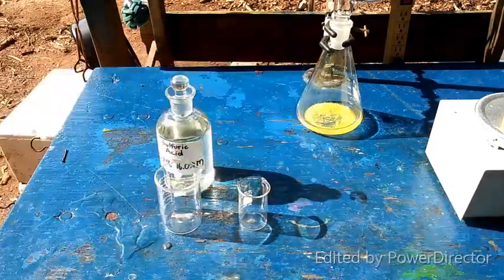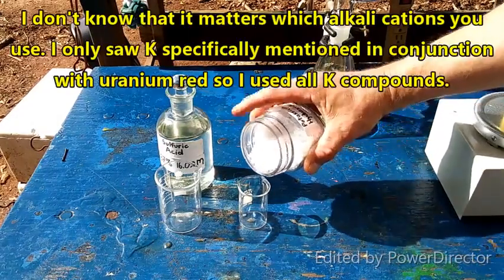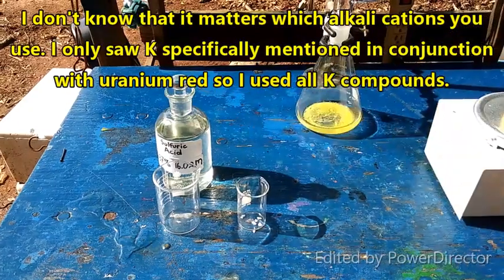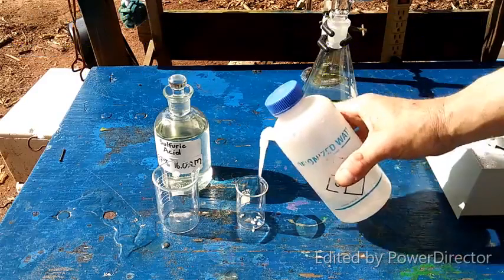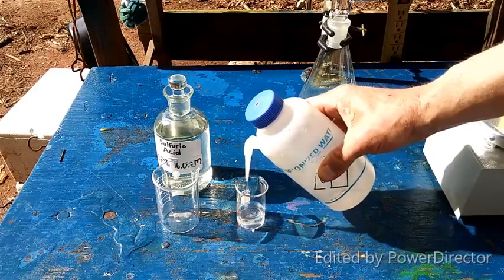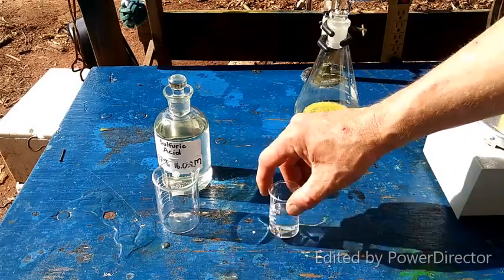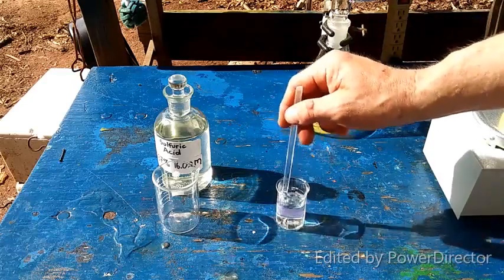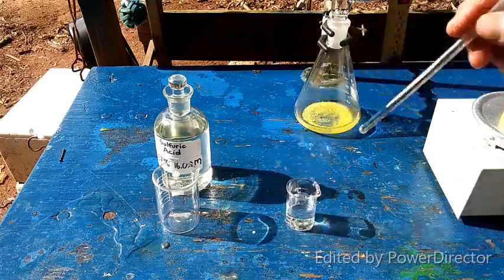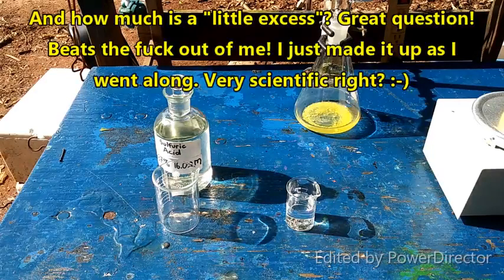Now, we are going to take a small amount of potassium hydroxide. Not very much. We don't need a whole lot. So maybe just a little bit like that was what I used last time. Go ahead and make up a solution here. Because you don't want to go overboard on the alkali. That would probably screw it up. I don't know, since I haven't ever done that. But given that Atomistry says a little excess alkali, you definitely don't want to go overboard. Alright, that's got our alkali.